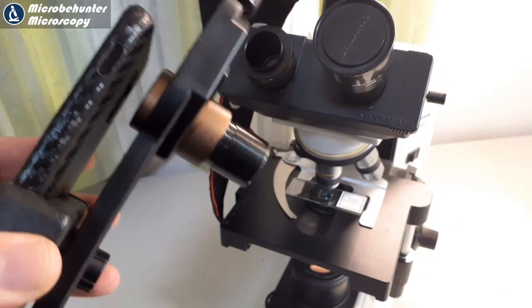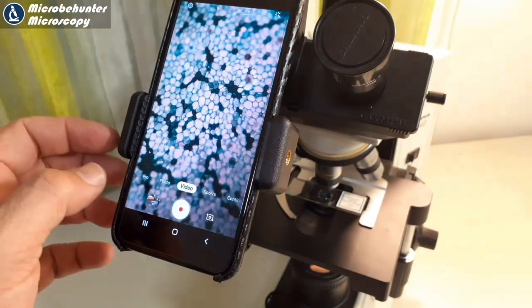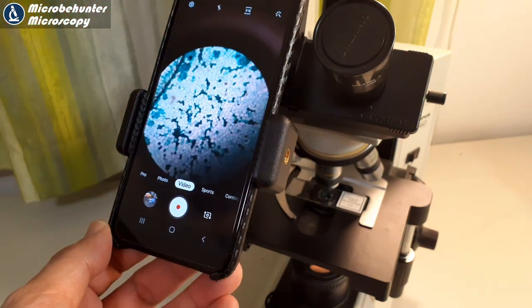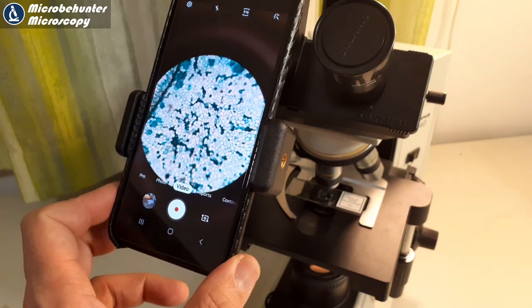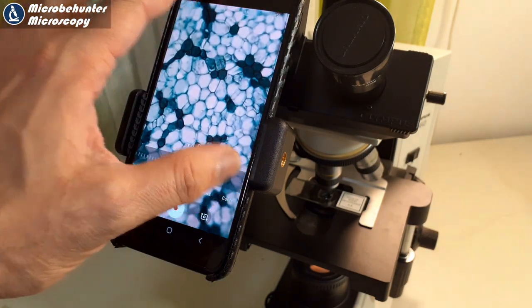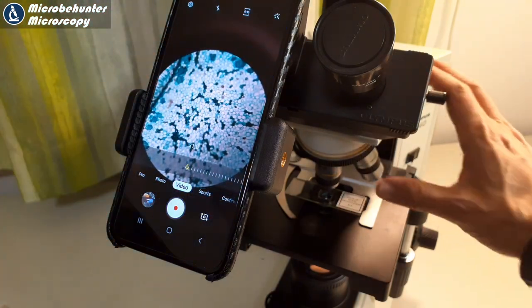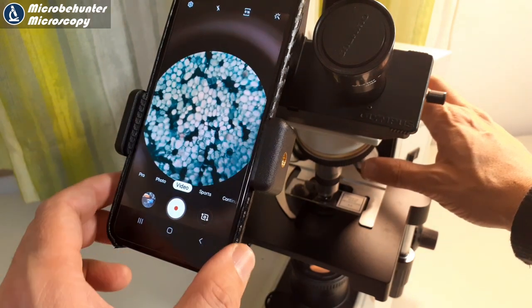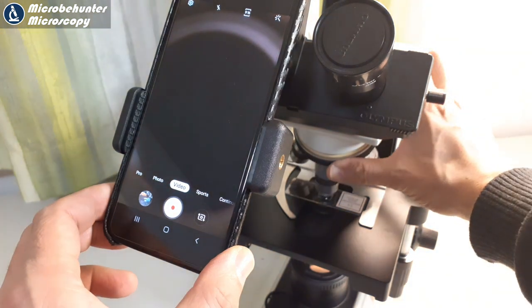Right now I've basically roughly aligned everything, and I simply plug it in to my microscope and get started. I'm using digital zoom and I can now take photographs and videos, but of course there is a little bit of a wiggle - that's a little bit in the nature of the system, also because the eyepiece-to-microscope connection is not completely tight. That's not the fault of the adapter, but simply part of the way the system works. You can also use it to do microscopy directly on the mobile phone screen, which is sometimes convenient if you do not want to look through the eyepieces for a very long time.